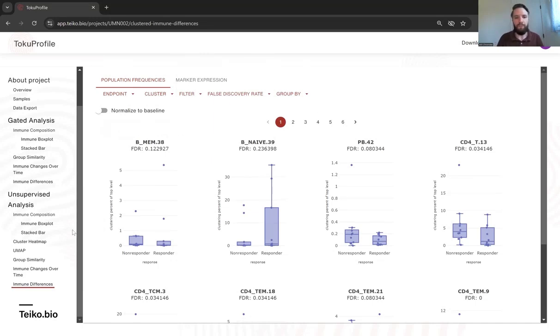With that, that concludes the premier, and that's a wrap. As you're thinking about doing a project with us, you might want to consider whether you have resources in-house that can do a lot of this analysis. If you feel confident that you can get everything you need out of just the data, maybe a base level project is right for you. But if you want to leverage our skills and expertise in the software we've developed to analyze this kind of data, we recommend you consider a core or premier level project to get the most out of your data, and we'll do our best to pull every interesting insight out that we can using our well-validated pipeline. With that, I will stop sharing, and if there are any questions, we can get to those.